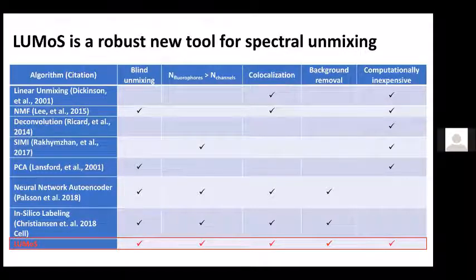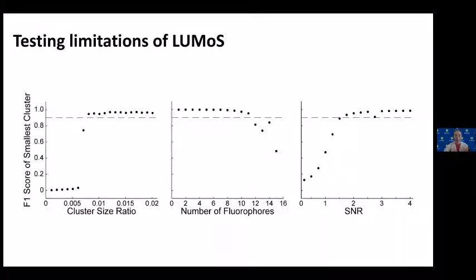I was thinking the detection channel in your context might be a combination of a detector's spectral characteristics as well as an excitation laser. The combination of the two gives you your detection channel. Am I right? That's a great point. I didn't go very deep into that.